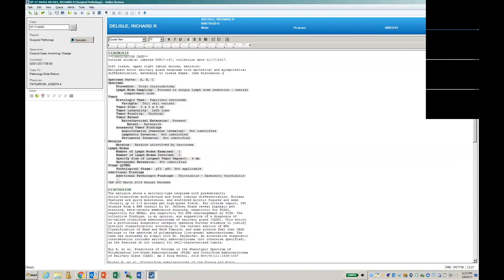But that is available for license, and you could build your own structured data. What do you have in mind when you talk about structured data? Well, reports. I don't know that maybe we wouldn't need a license if we have 4 or 5 other templates that we use that right now pathologists are just filling out on paper and submitting to transcription, and they're creating it.